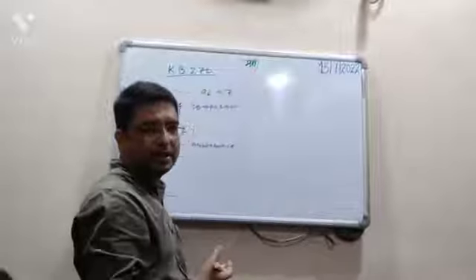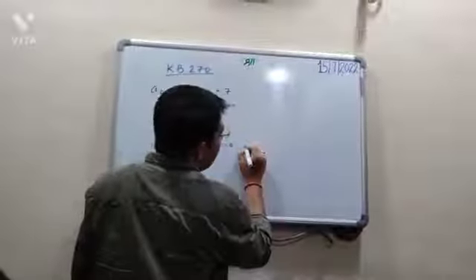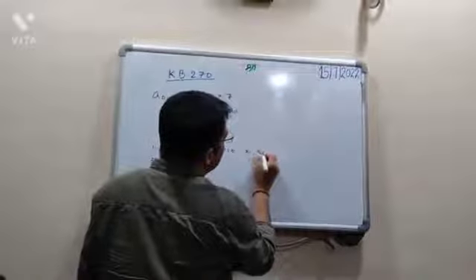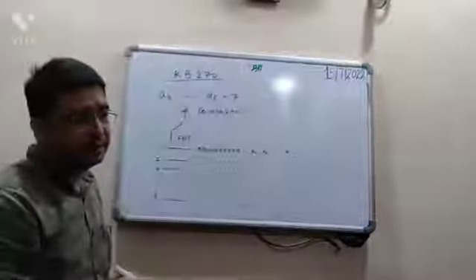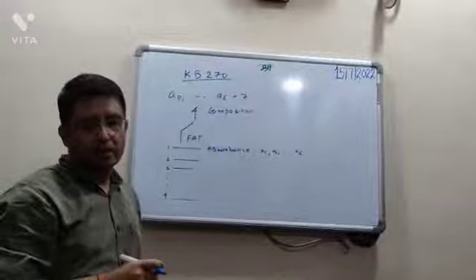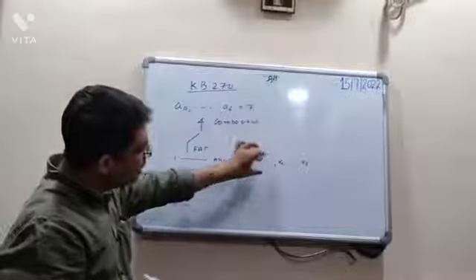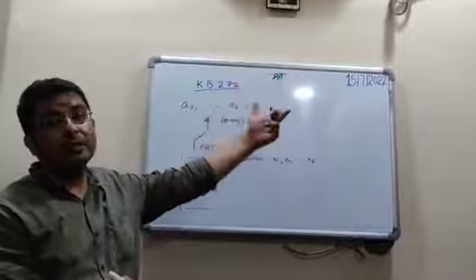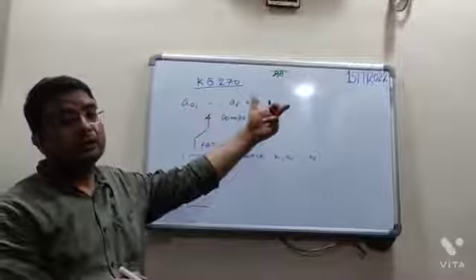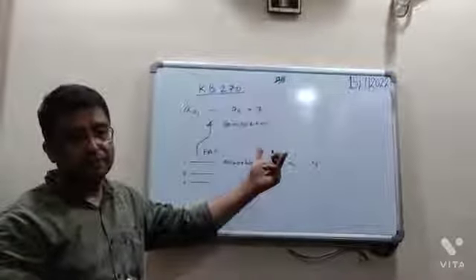They have used other variables for absorbance, that is x1 to x6, right? Can you see the values of x1, x2 up to x6 for each sample, not composites, for each sample.